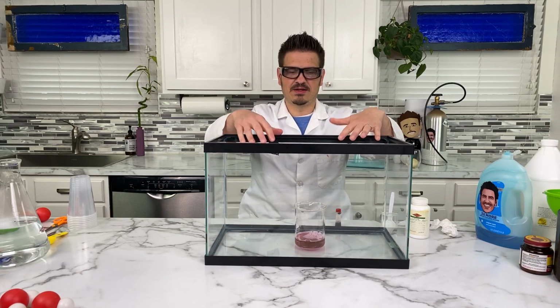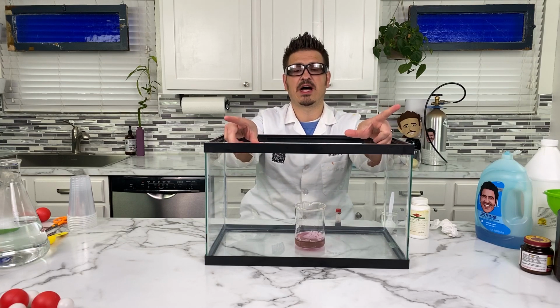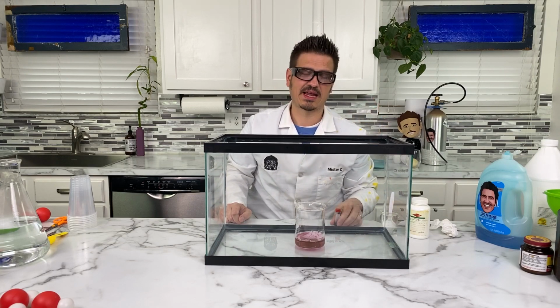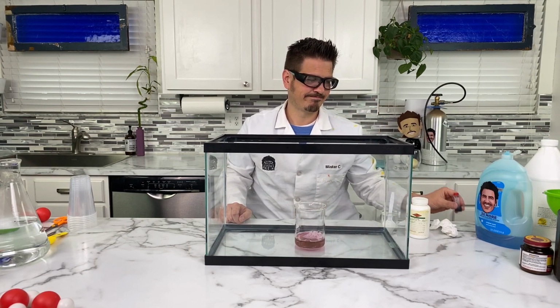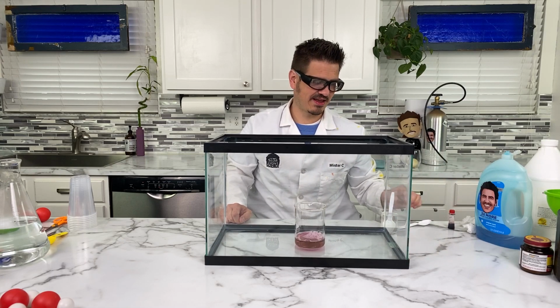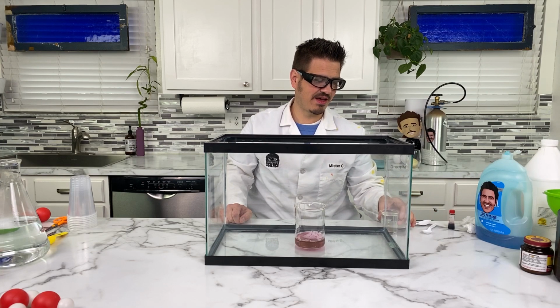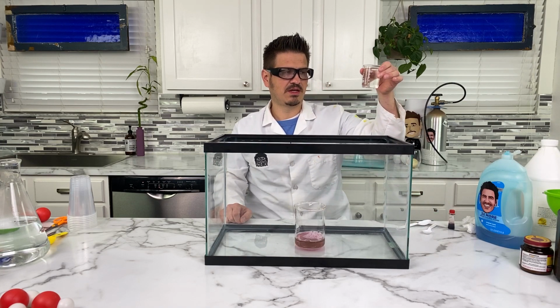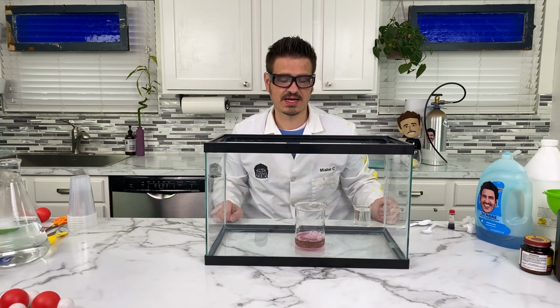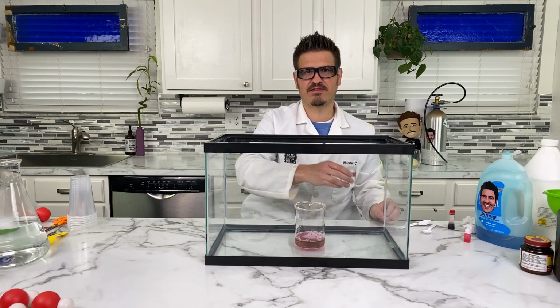Now this one, I intentionally didn't put an Erlenmeyer flask in here because I don't want it to shoot up and hit the ceiling and get on the ceiling and stain anything up there. We've never done that before. All right, so I have my solution, potassium iodide. It's going to be our catalyst. It's going to break down that hydrogen peroxide very rapidly. And hopefully we get a good foam out of it.